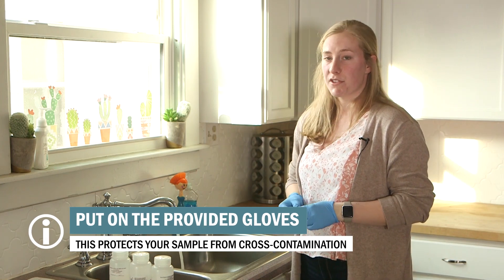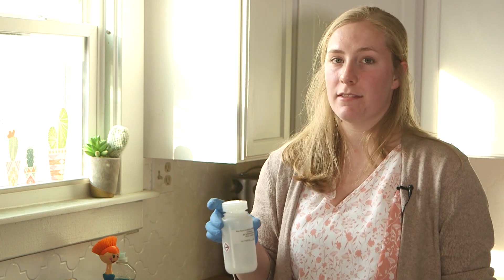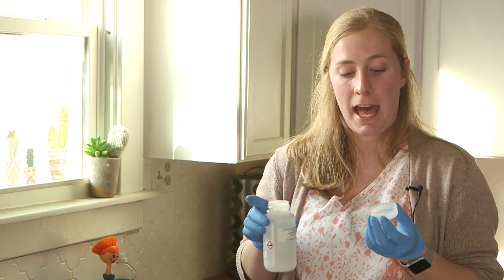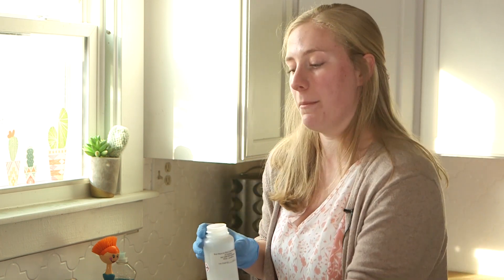Now you'll want to reduce the water flow to the thickness of a pencil. This will help prevent splashing while sampling. Take one of the three unmarked preservative bottles and carefully remove the cap. Be careful not to touch the inside of the cap or bottle as this could contaminate the sample. If you need to set down the cap, you can do so, but make sure you do it upside down.